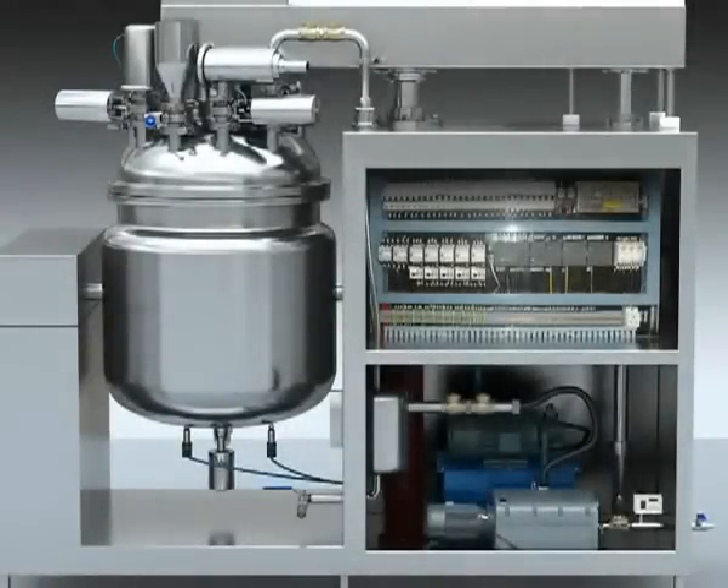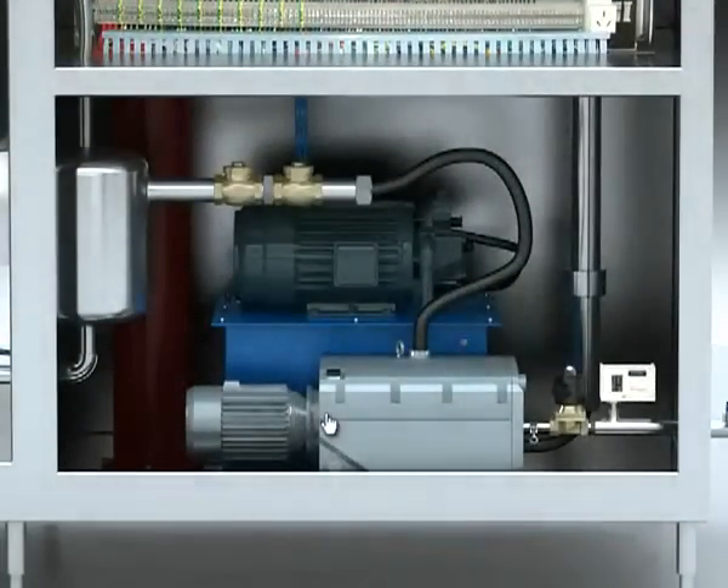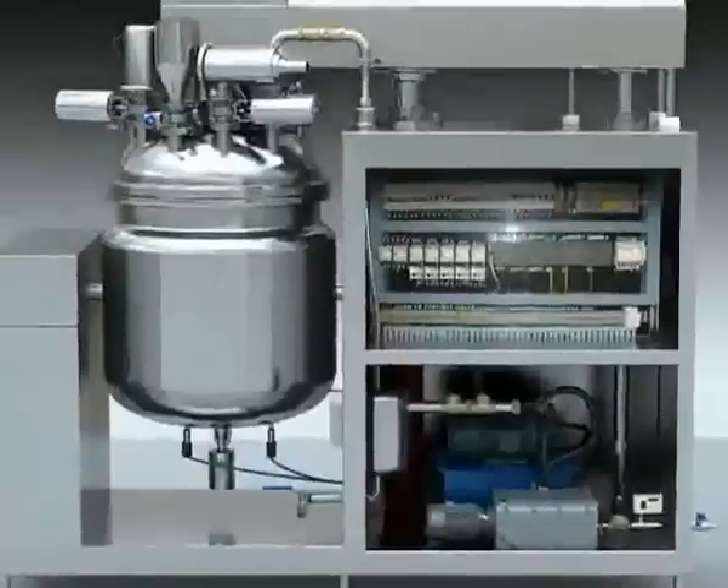2. Vacuum system. It is made up of a vacuum pump, vacuum buffer tank, check valve, vacuum meter, water pressure relay, vacuum thermatic valve, and water electromagnetic valve.